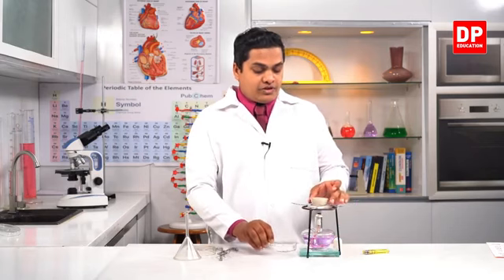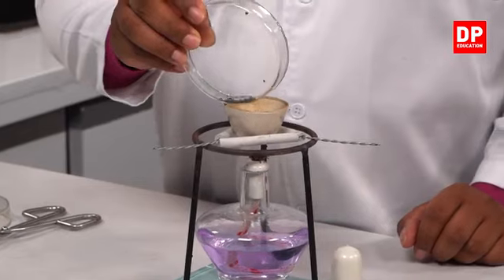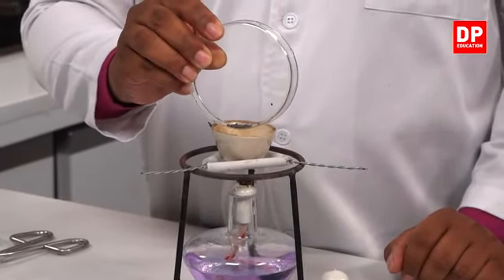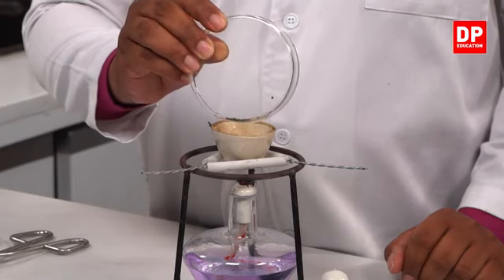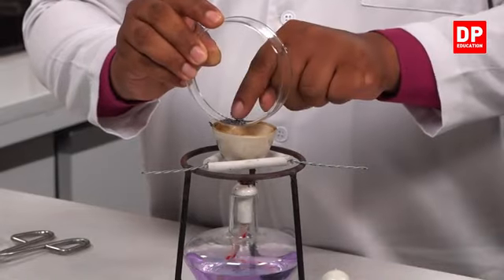So let's see what will happen when I heat these iodine crystals. I'm using a crucible, and I'm going to add a few iodine crystals into the crucible like this. Then I'm going to heat it.